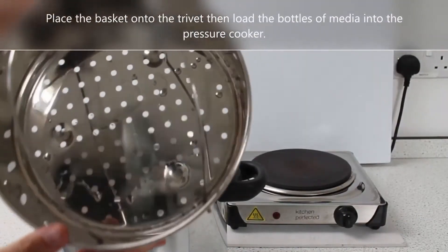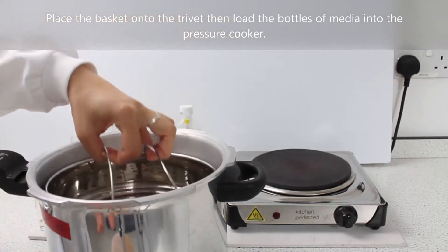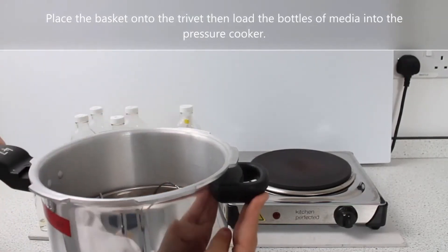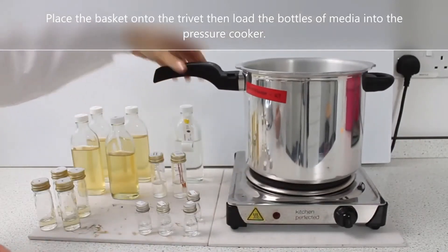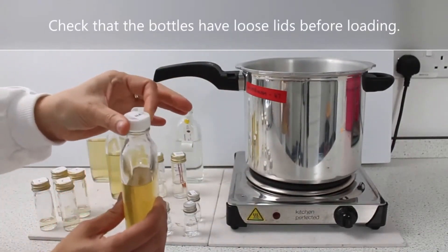Place the basket onto the trivet then load the bottles of media into the pressure cooker. Check that the bottles have loose lids before loading.